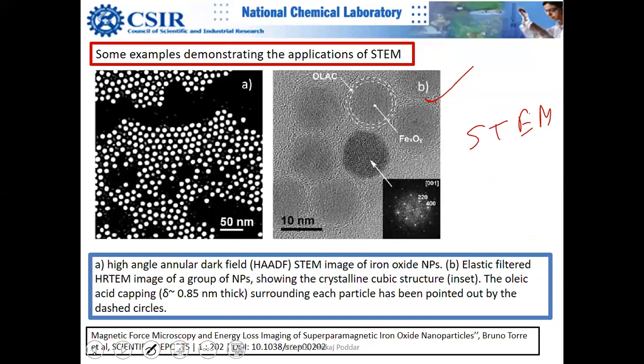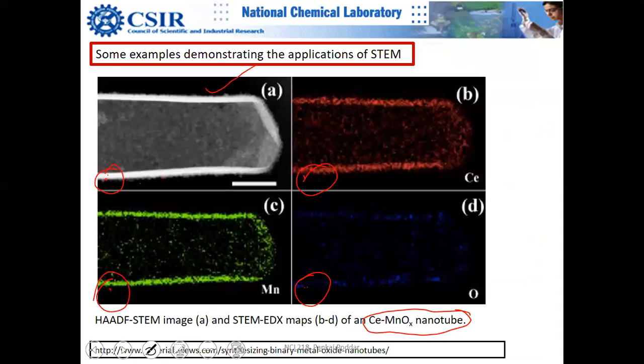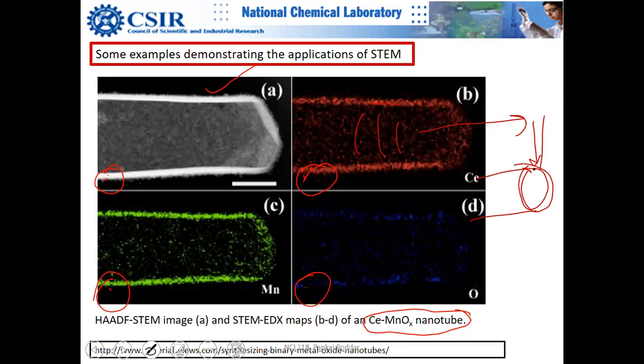So all this data which you are seeing in this image, that's why you can see here in this image that you have the red dots here on this side also, not just at the periphery, because if you see the rod is like this, right? I explained it in the class very well. When you are bombarding electrons, they are going through this layer here and then this layer, right?